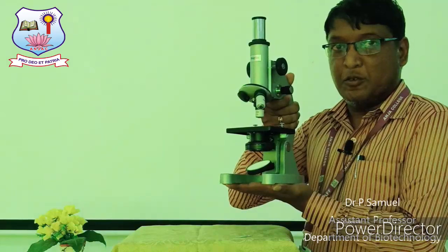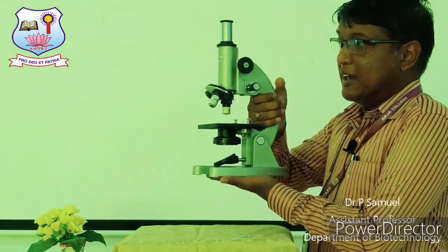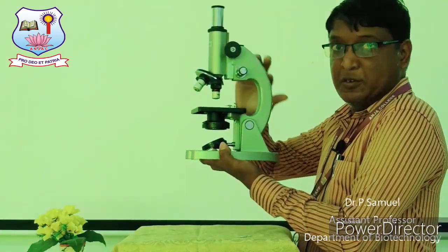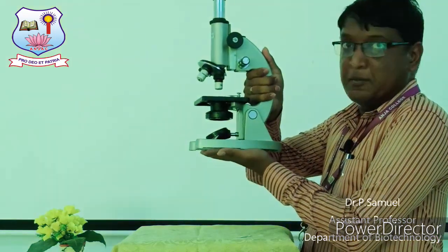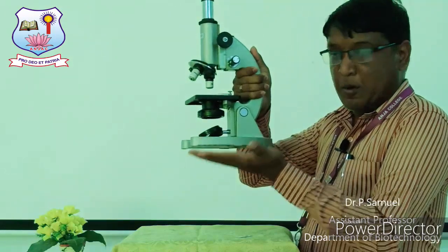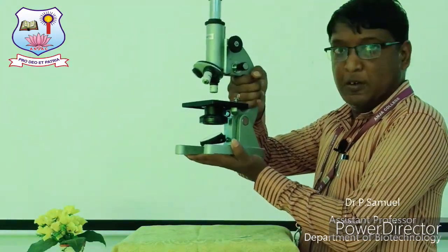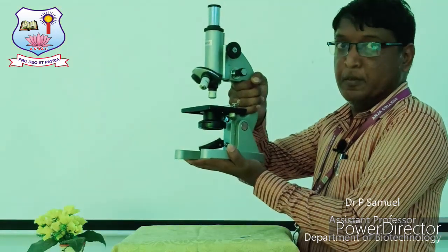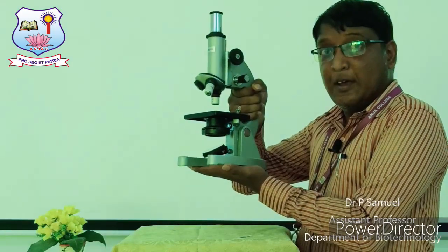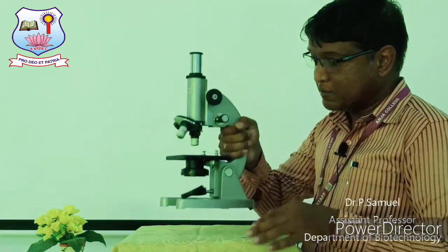While carrying your microscope in your laboratory, this is the way to carry it, like carrying a duck. This is called the neck portion. This is called the base of the microscope. Use your left arm to bear the base of the microscope, and with your right hand hold the neck of the microscope. This is the proper way to carry it, and this is the proper way to avoid accidental loss of lenses from the microscope, right? Fine.